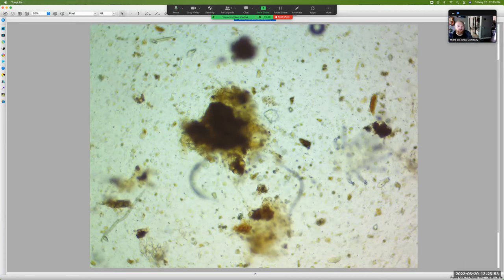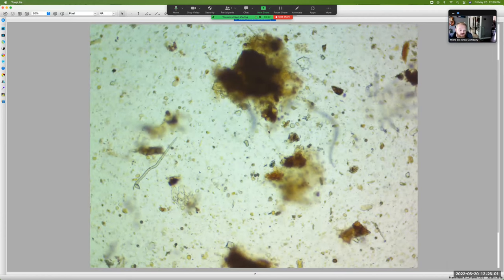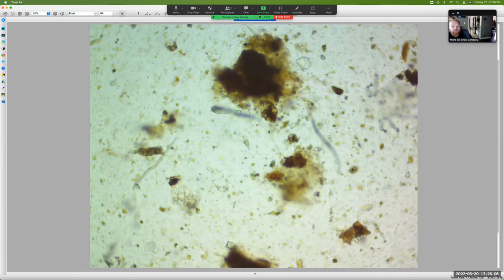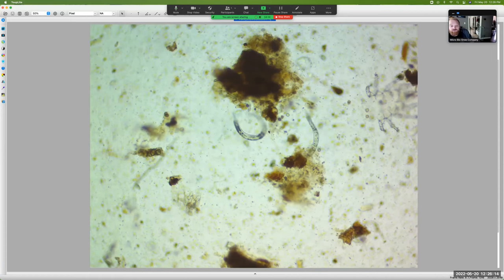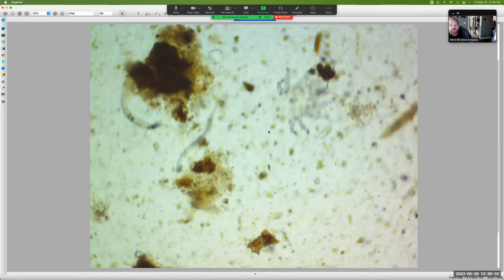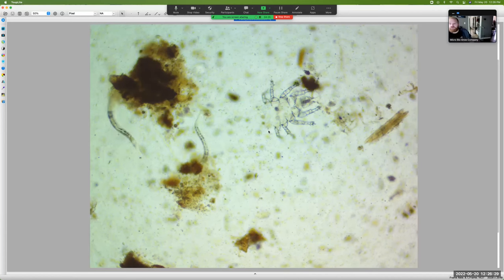I'll drill down some more to really tell. Oh, is that another one? There's three nematodes — wait, no, I'm sorry. So we do have two moving. There's obviously some filamentous organism down there — I can kind of see it as I scroll around. If I can try and catch a still later I'll go through this frame by frame. We'll try and see what we find there — maybe even find the body of that chopped-up guy.